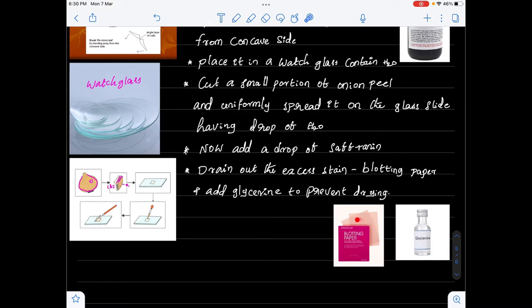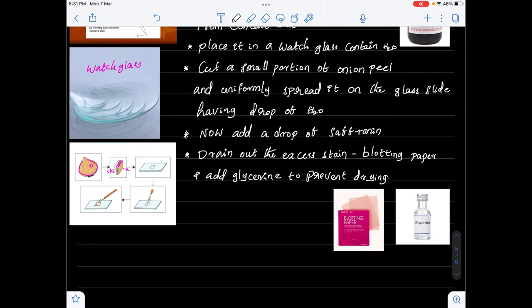And here is the blotting paper — it looks like tissue paper but its composition is different. It helps in the removal of excess stain. After adding glycerin to the material, we should cover it with a cover slip without formation of air bubbles.